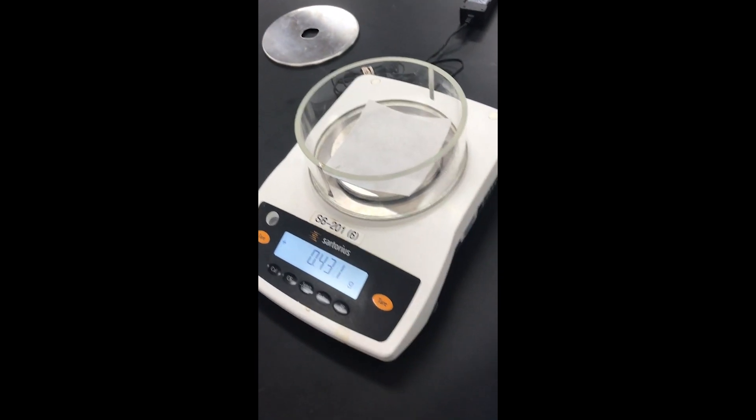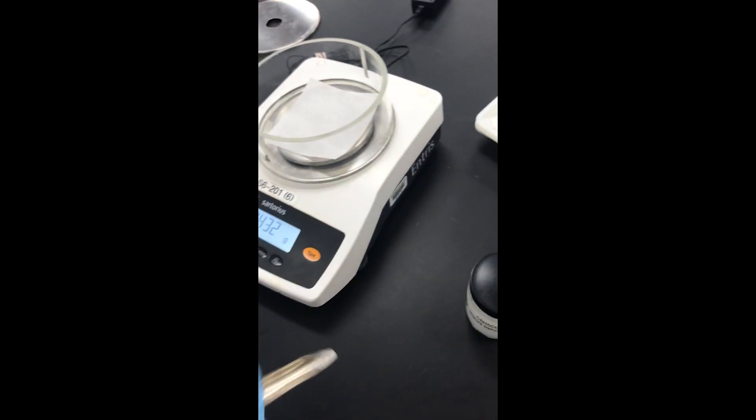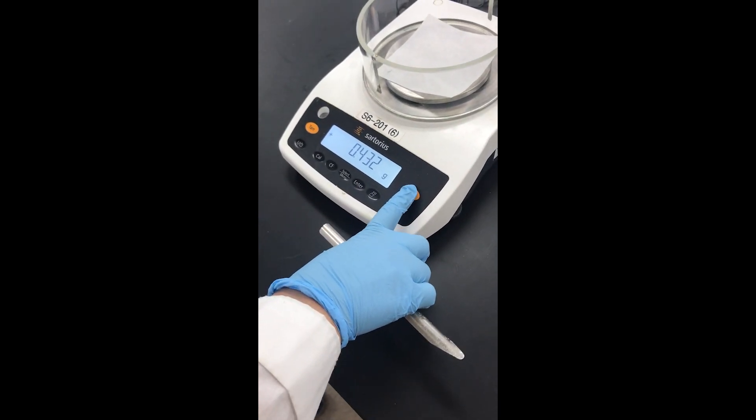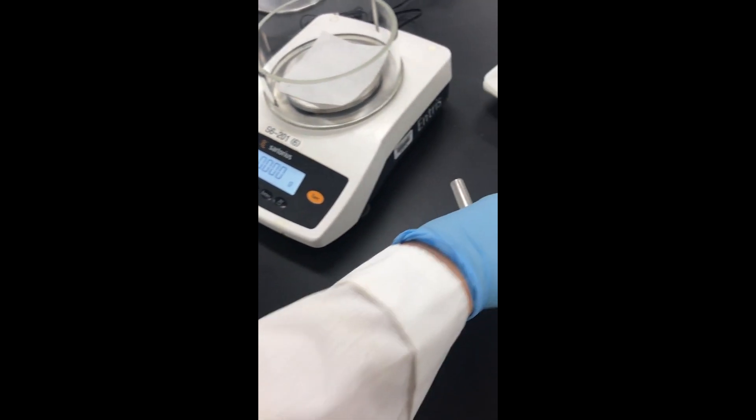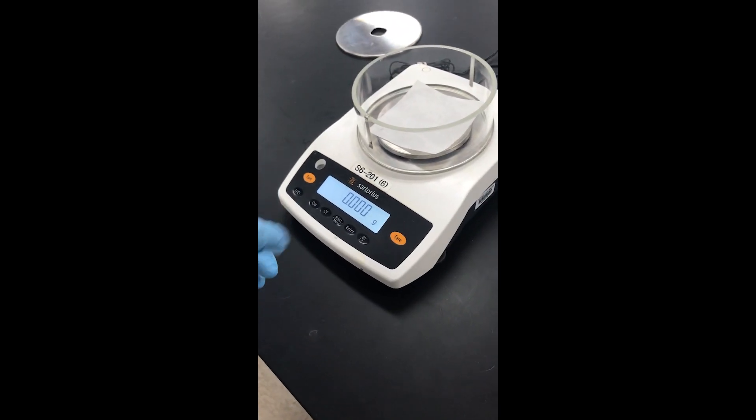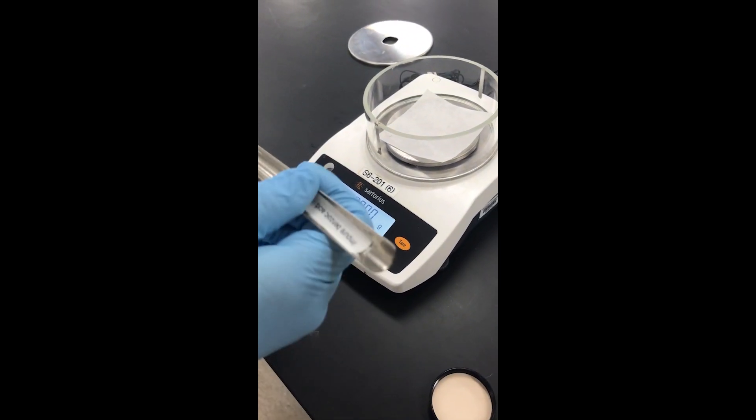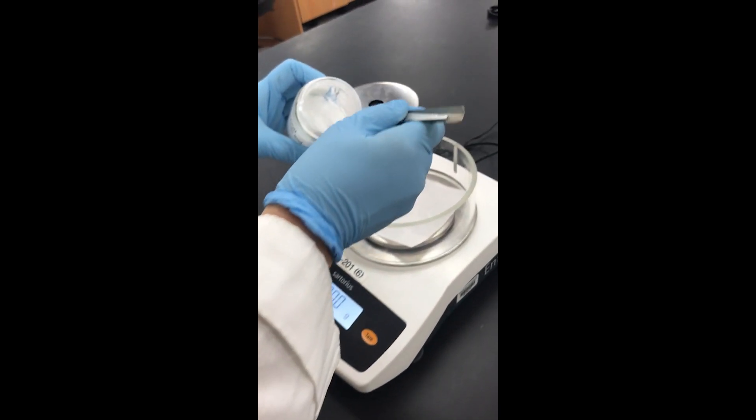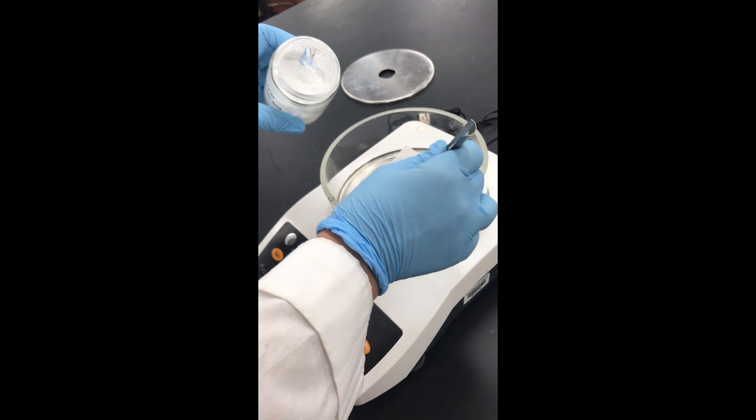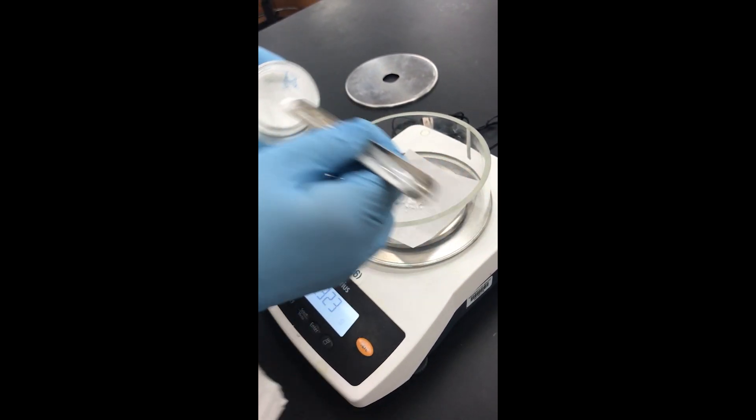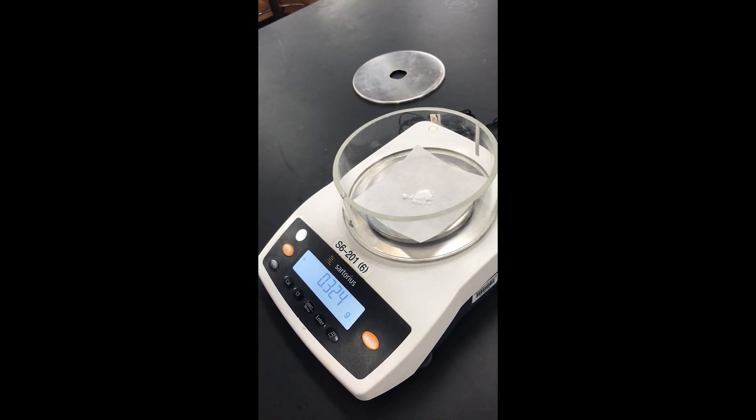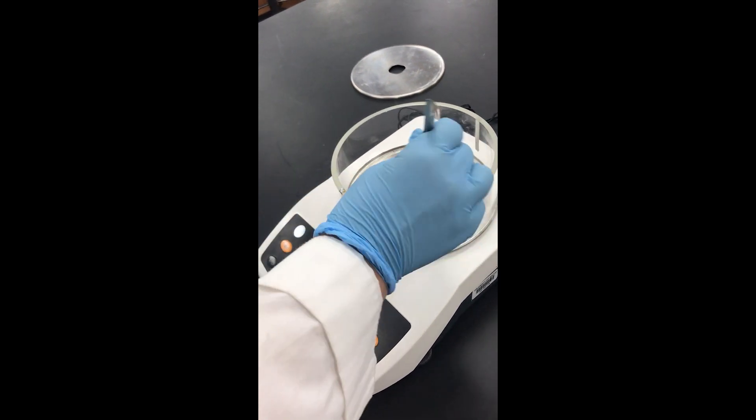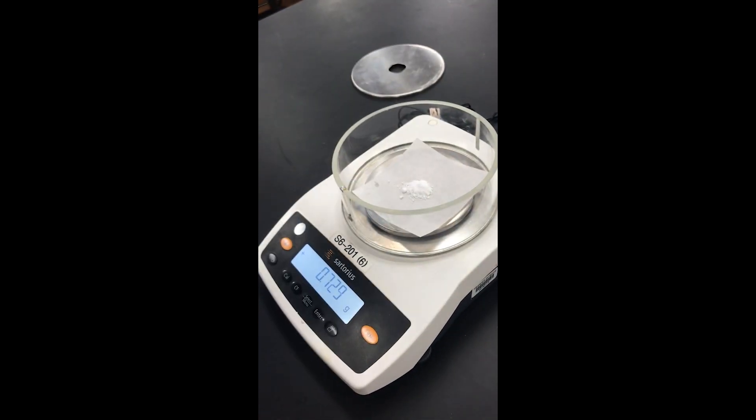I'll place that on there and tare the scale so that I don't have the mass of the weigh paper in with the mass of the solid. I'm going to get about a gram and carefully add some impure benzoic acid. So that's about 0.3 grams - gives me an idea how much to do.